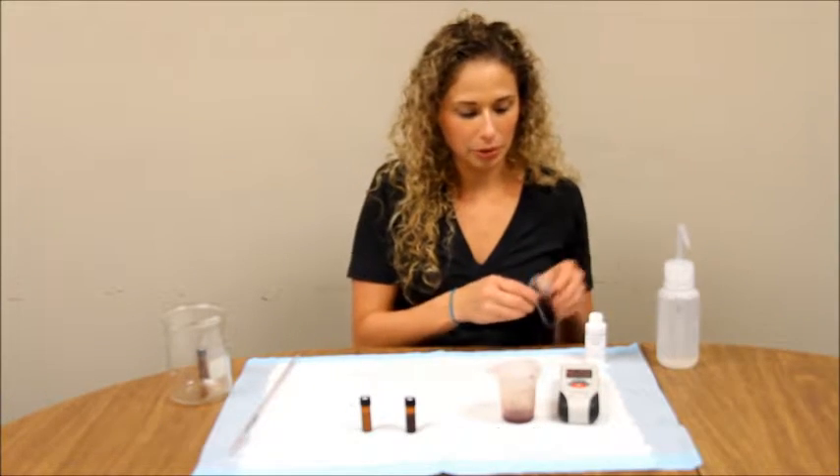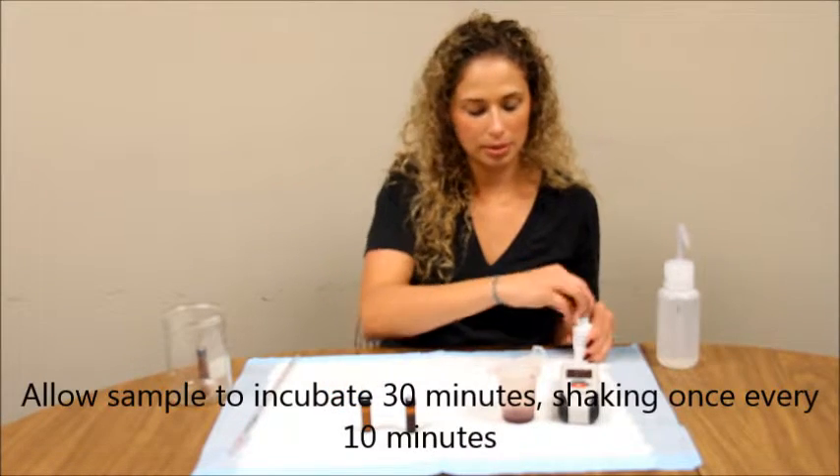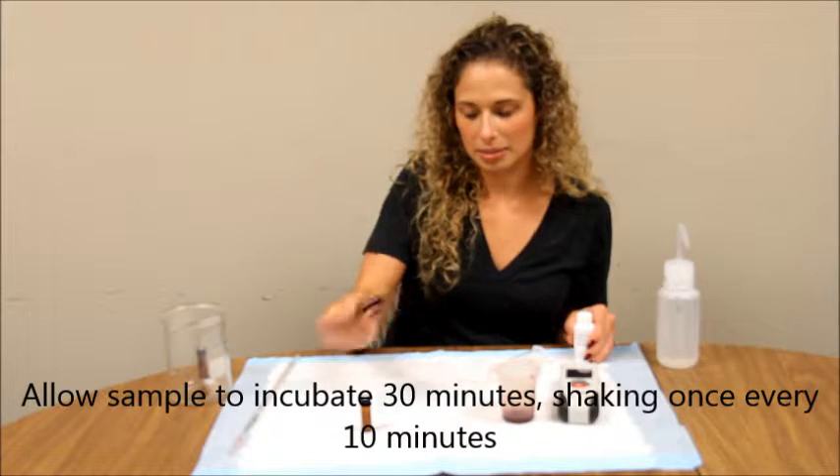Now let your vials incubate for 30 minutes, shaking once every 10 minutes.